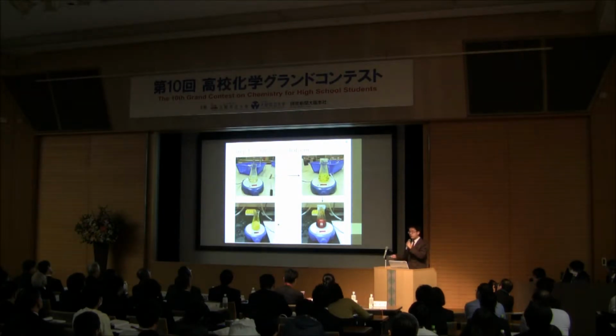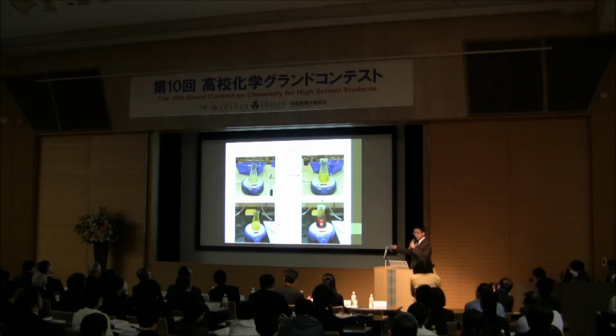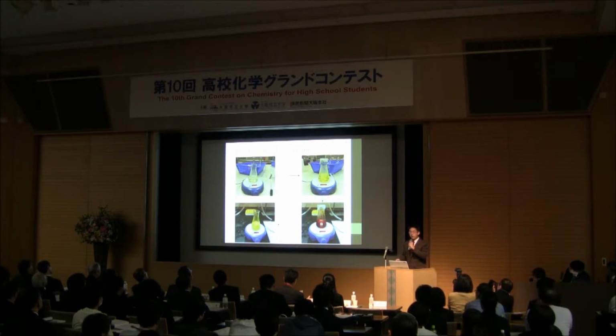So these are some images that we took during the reaction process. This is sodium hydroxide and 4-formyl benzoic acid dissolved in water and ethanol. This is after the addition of 2'-hydroxy acetophenone. This is after 24 hours of reaction, and this is after acidification with hydrochloric acid.